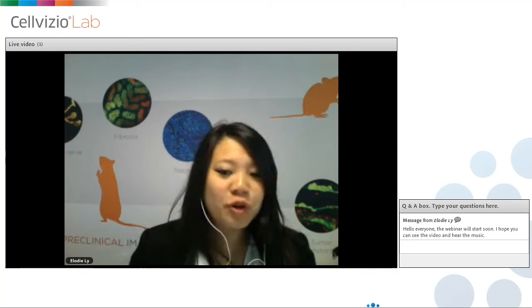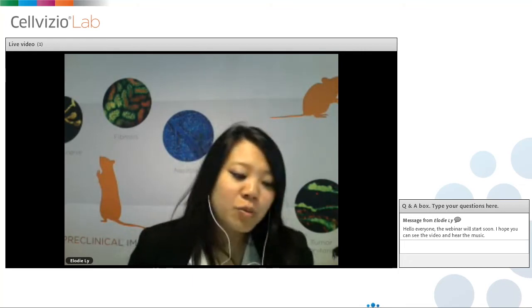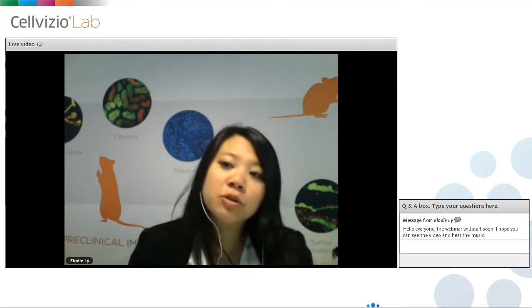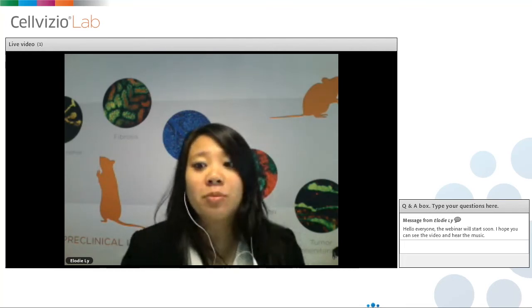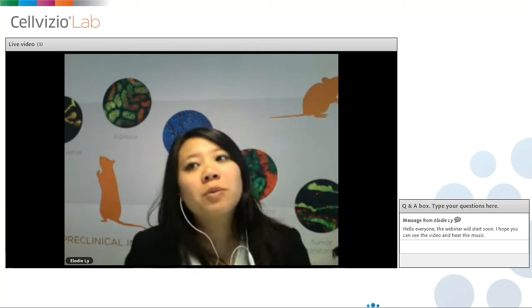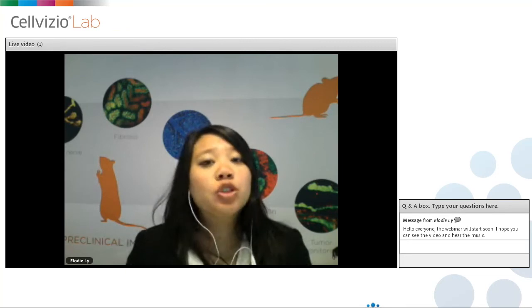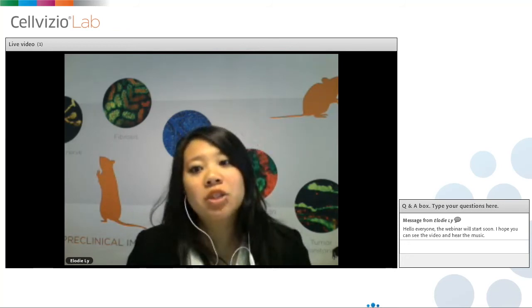So I have a first question regarding fluorophores. So what types of fluorophores can we use to look at vasculature? So I gave you some examples during the presentation. So one that is very common is FITC that is coupled to dextran. So dextran is a biopolymer, and you can choose the size of the dextran molecule for your experiment, depending on what phenomenon you want to image.